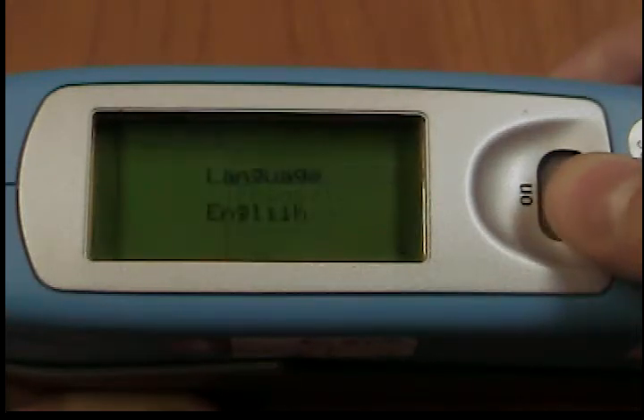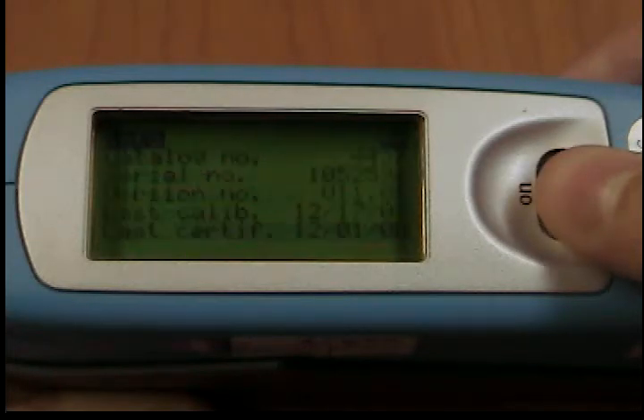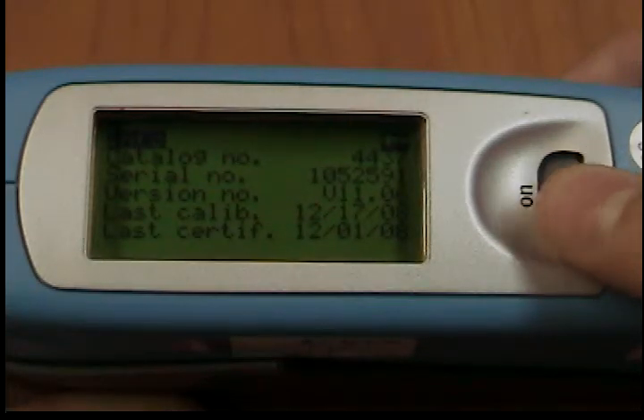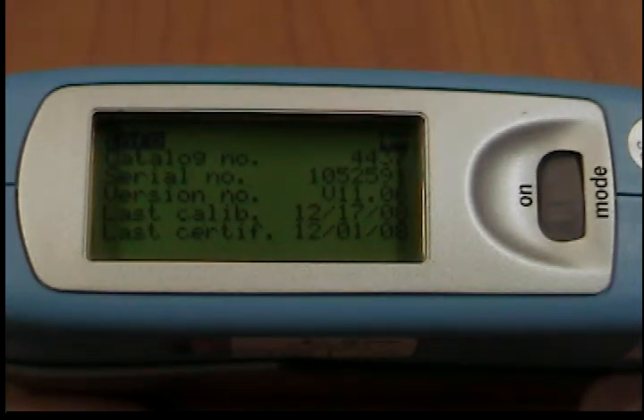Info. You can use this menu option to find the following information: catalog number, serial number, version of the firmware, date of the factory calibration, date of last calibration, date of last certification, and date of last location.